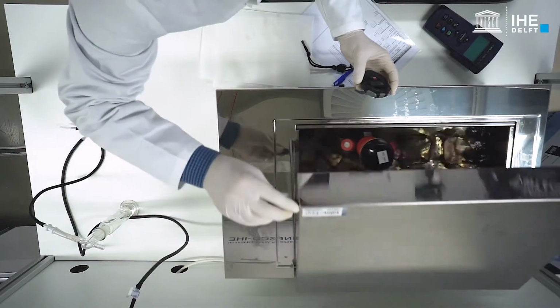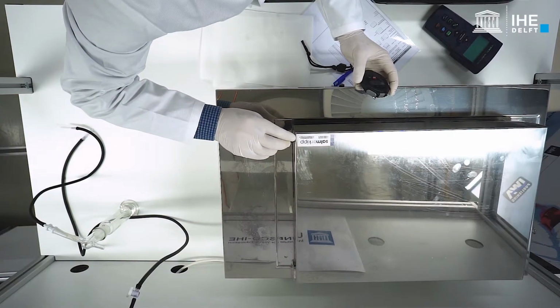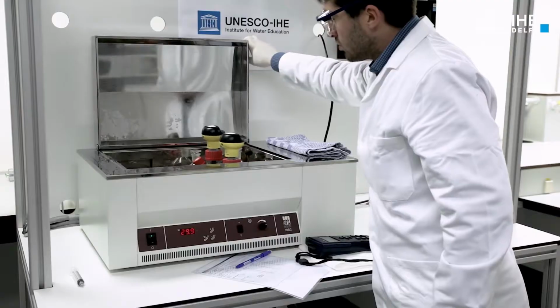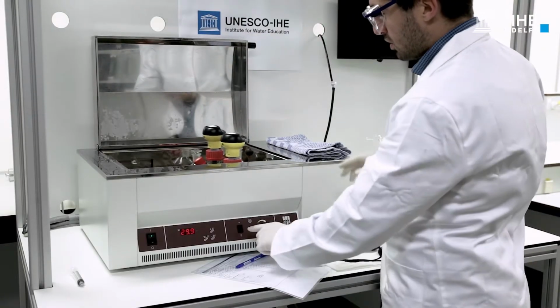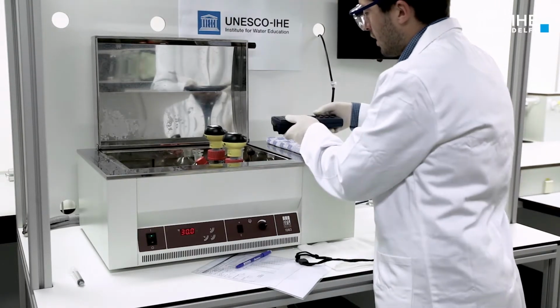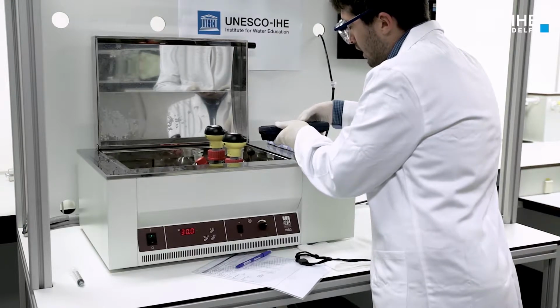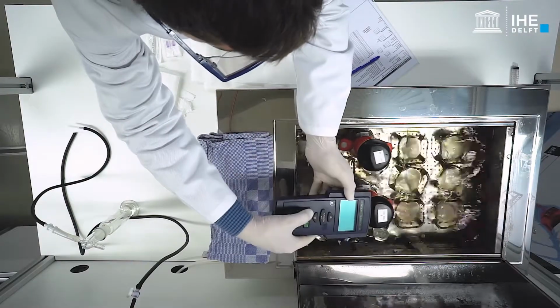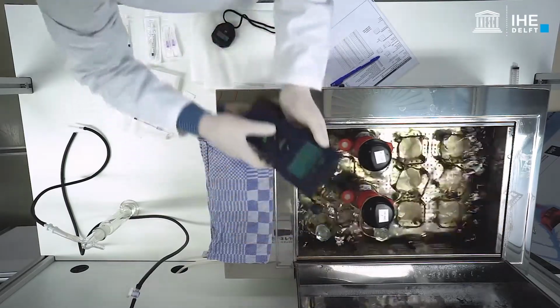Activate the pressure monitoring system and keep it working for a pre-incubation phase of approximately 1 hour. After 1 hour, verify that the temperature and mixing conditions are stable. The pre-incubation phase will create endogenous conditions and adjust the temperature of the reactor to the set point. If readily biodegradable organics are present, the pressure might not reach a constant value.